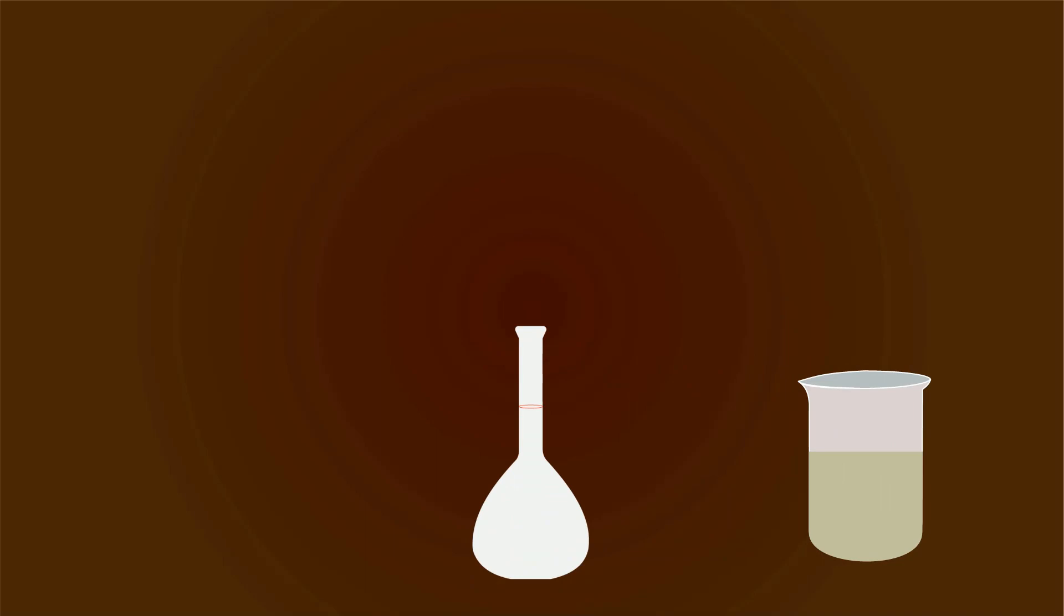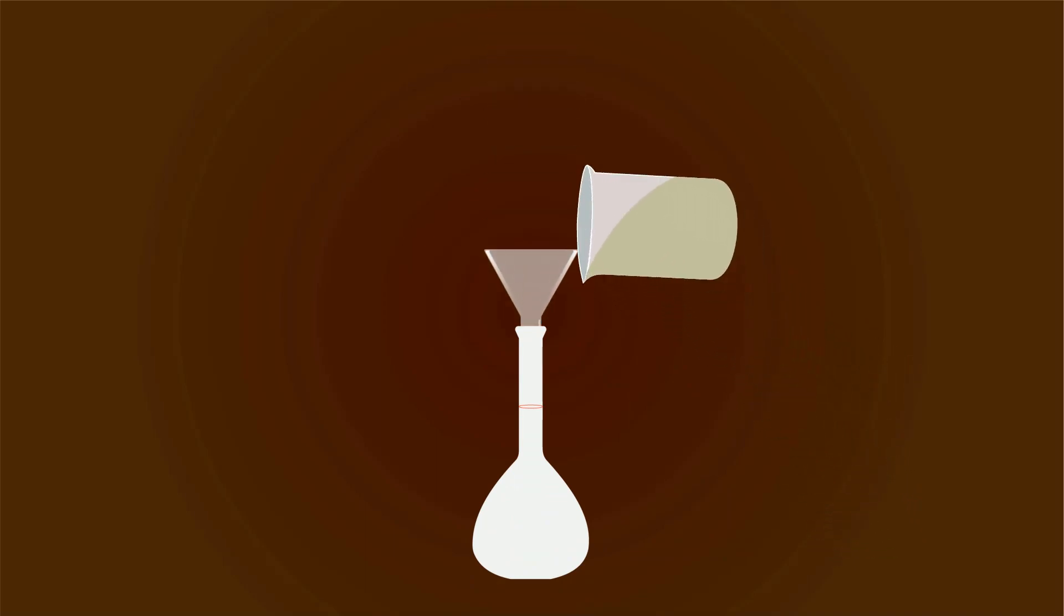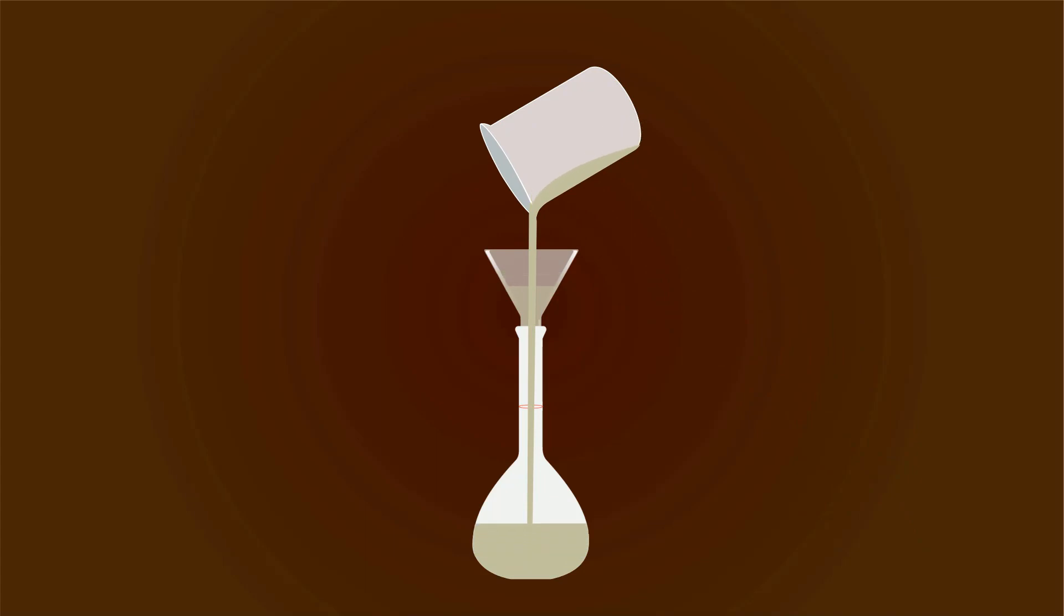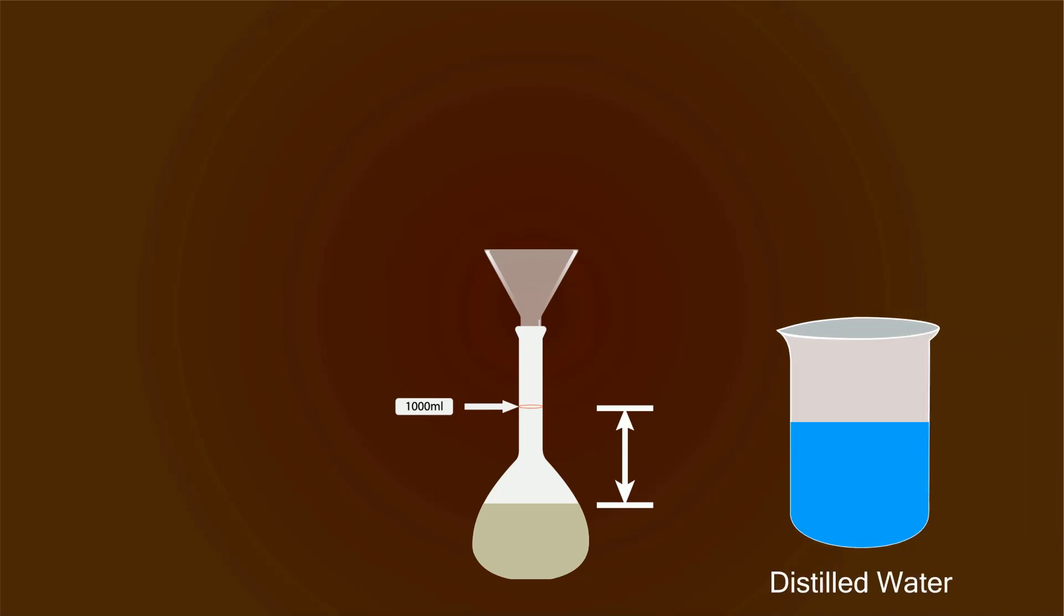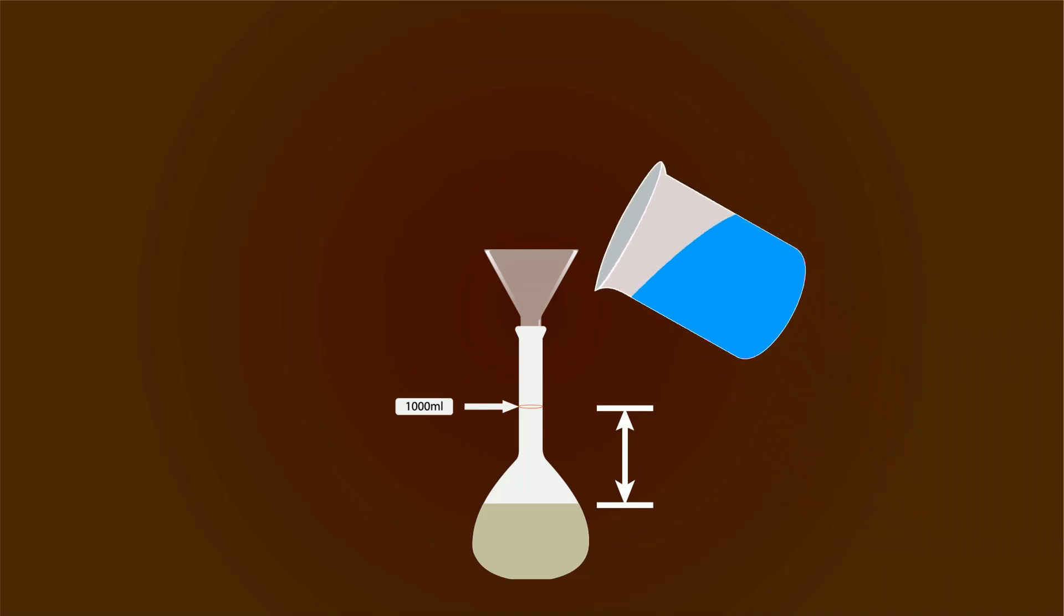Now take a volumetric flask of 1000 milliliters and put a funnel on the top. Start pouring down the solution. You have to fill it up to the red mark of 1000 milliliters. So for that you can add more distilled water into the volumetric flask. Start adding more distilled water up to the red mark.